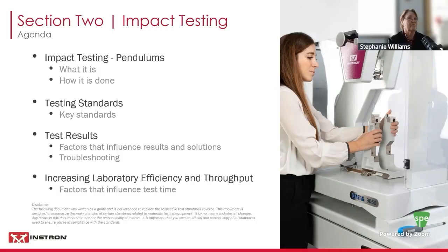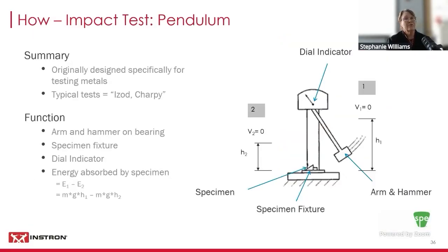and increase the throughput? So first, I'm never sure with these things who is familiar with how any given piece of equipment works or not. So always throw in a slide about what the equipment we're talking about is and how it works. So, pendulum test, very basic, very simple.